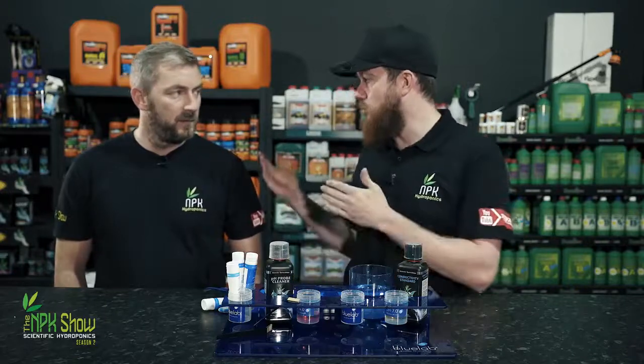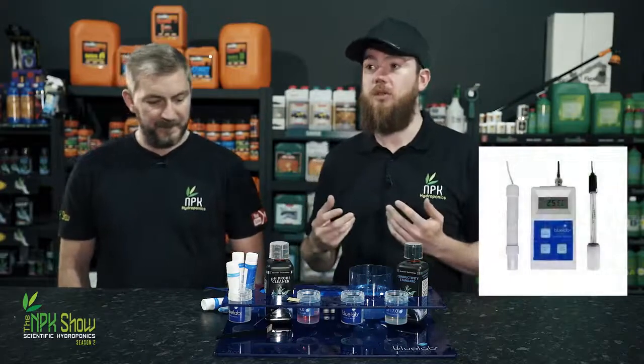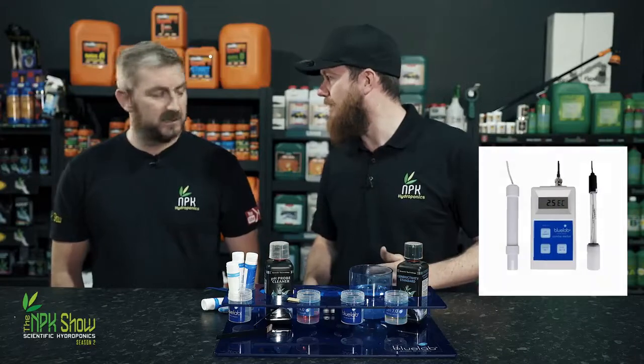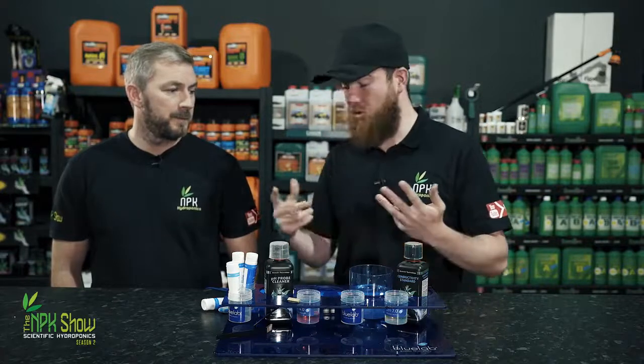Up on Barry's right, though, we have another piece of kit. It is the combo meter. The combo meter is for people that want portability. That's good for flexi tanks and stuff like that, isn't it? Yeah. When you've got multiple flexi tanks, you take the combo meter, you move around, and it measures water temperature, EC and pH all in one.